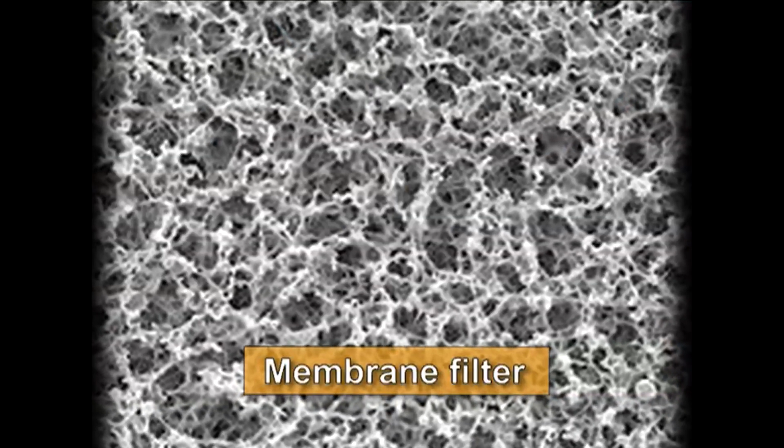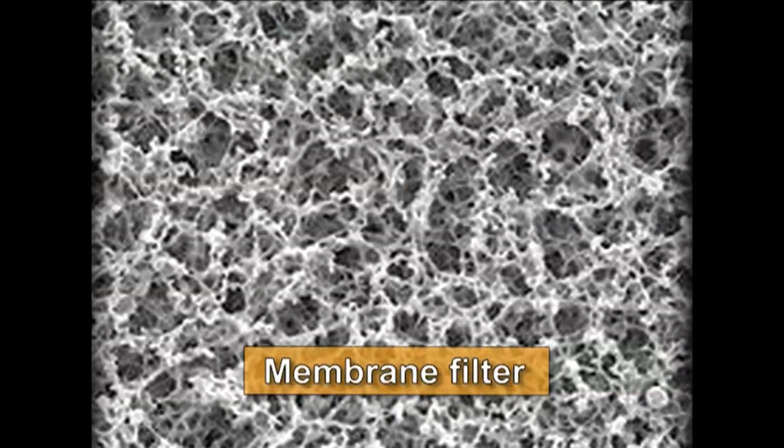It means these membrane filters are to be used to sterilize only those compounds which are heat labile. And one more additional point is that we can increase or decrease the pore size of membrane filters depending on the concentration of the polymer that we are using for making the membranes. If we increase the concentration of the polymer, then the pore size will decrease, and if we decrease the polymer concentration, the pore size is going to increase. In this way we can regulate the pore sizes.